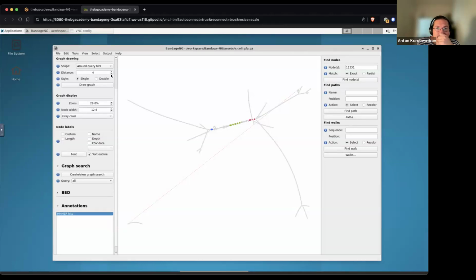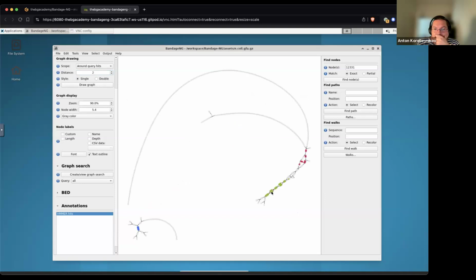Definitely the topology of the graph suggests it, right? There are multiple copies, right? All these unresolved bubbles, etc. Well, we know that for E. coli there are, at least for the 16S, that typical repetitive structure here. So you see there is that repetitive edge, and two inputs and two outputs, and we don't know if the assembler was able to connect inputs to outputs here. Plus, we know how many copies are there in E. coli, if it's 6 or 7, I don't recall. Definitely the assembler collapsed a couple of them, but that's fine.